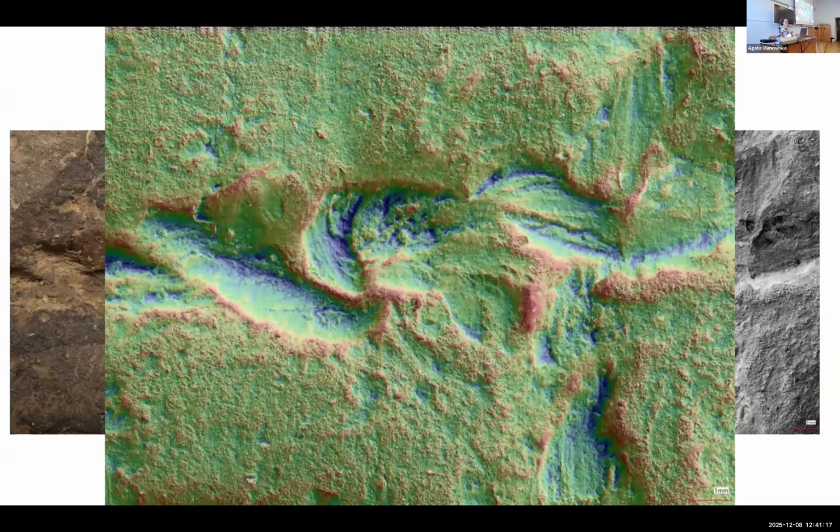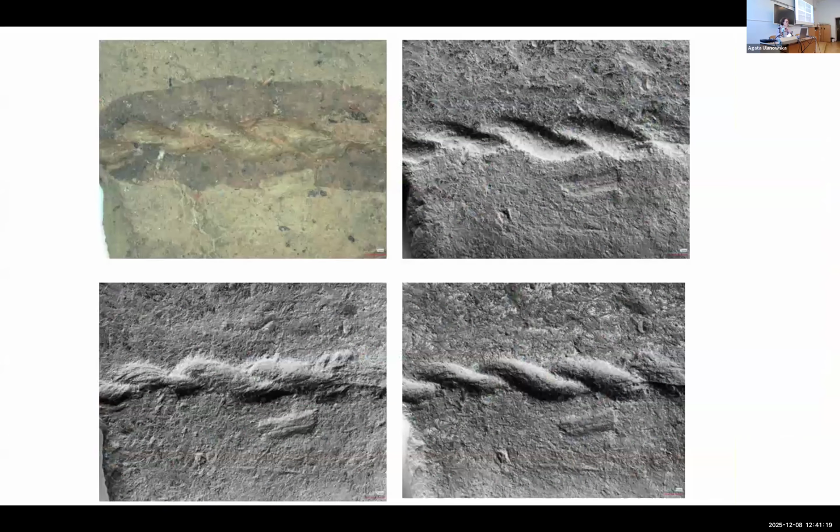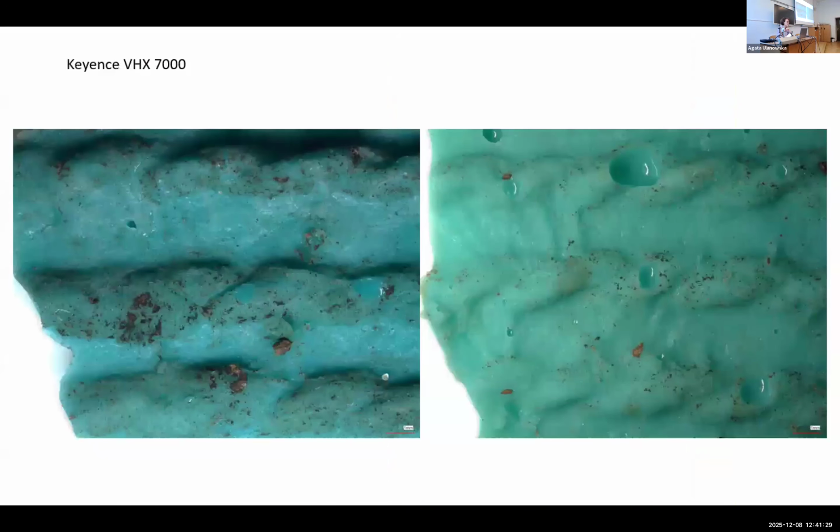So Keyence also works quite well. So more pictures, and of course here you can see this ugly trace left by silicone. And again, casts.